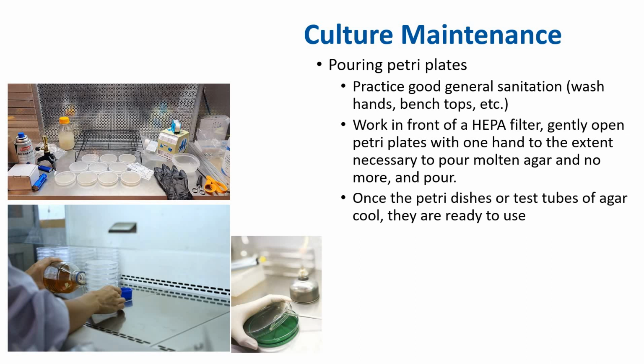That works as well. First, you want to make sure your lab bench is clean. You see this picture right here? There are too many things in here, right? Too many sources of contamination. Spores on this bottle can be blown onto your plate, right? Spores on this box, the spores on this rack. So you don't want your workspace to ever be this busy. You want it to be like this picture here, where you put the sterile petri plate where the sterile air is, right?